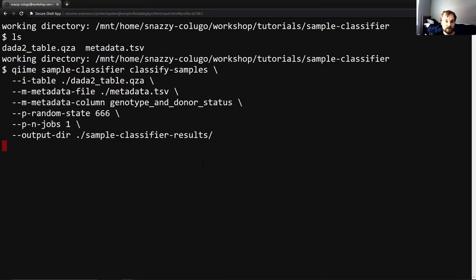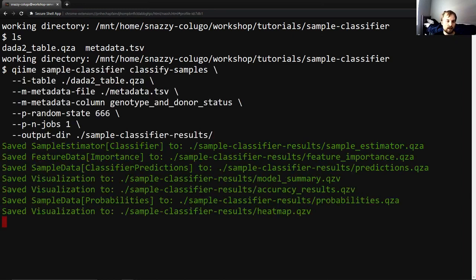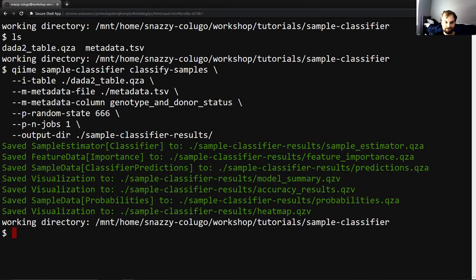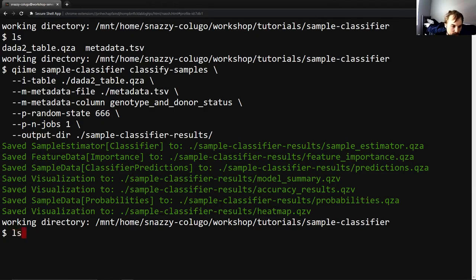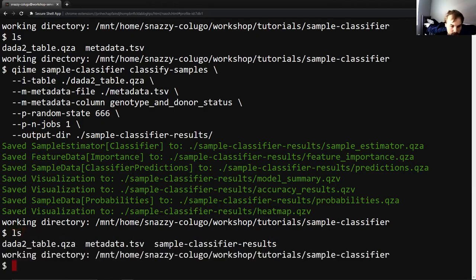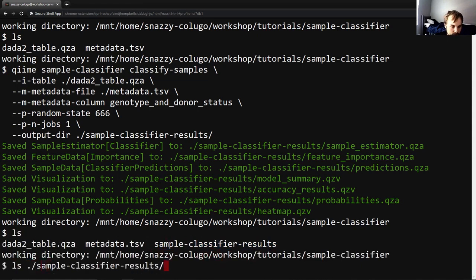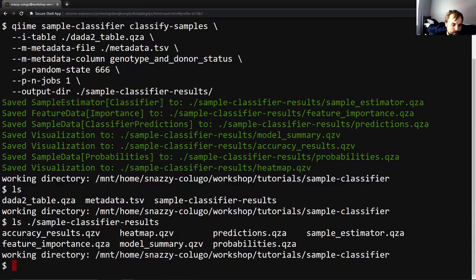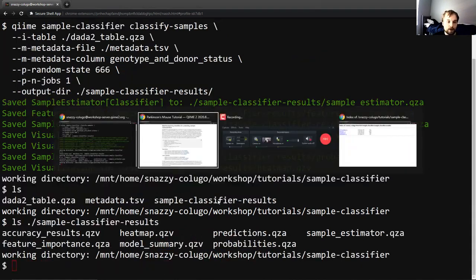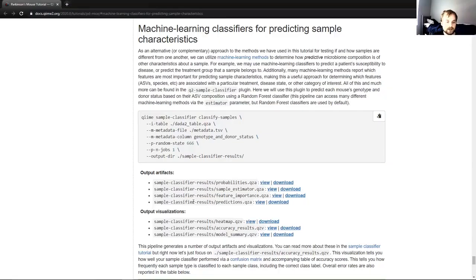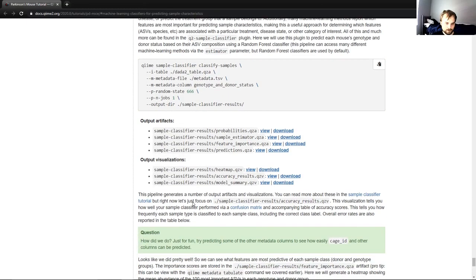And when it's finished, you'll see that we have seven files. Four QZAs, three QZVs, all in this sample classifier results directory, and there we are. So what are we going to do with this? Well, what we're going to do is check how we did.